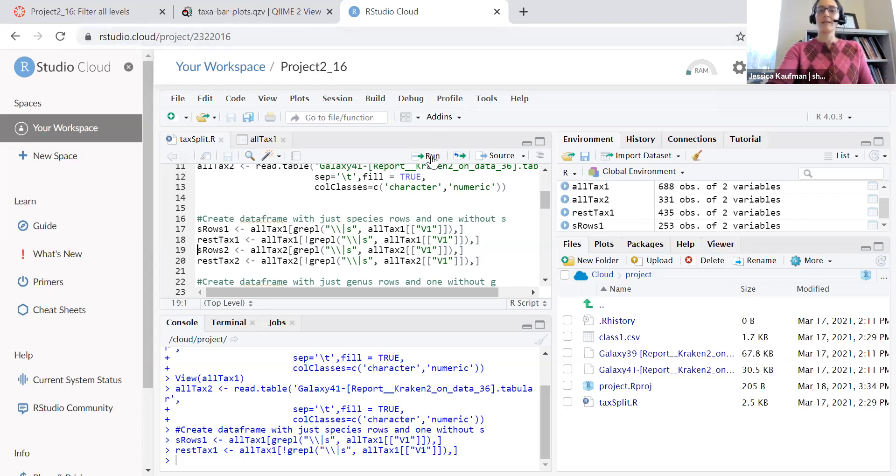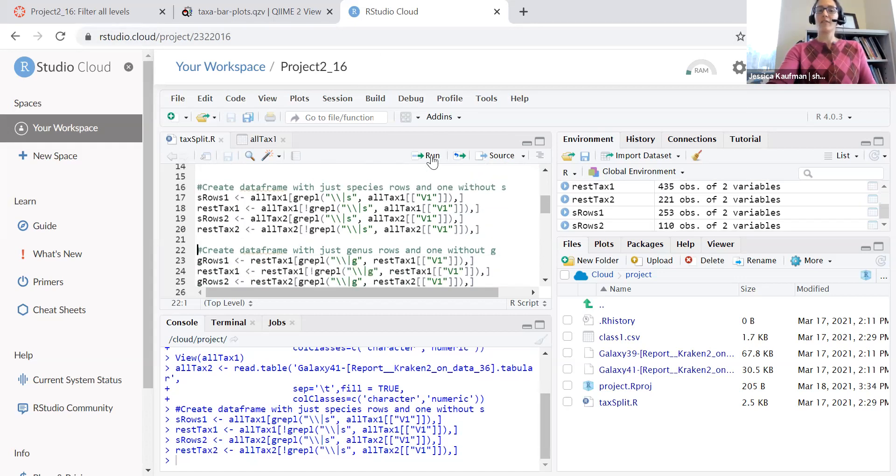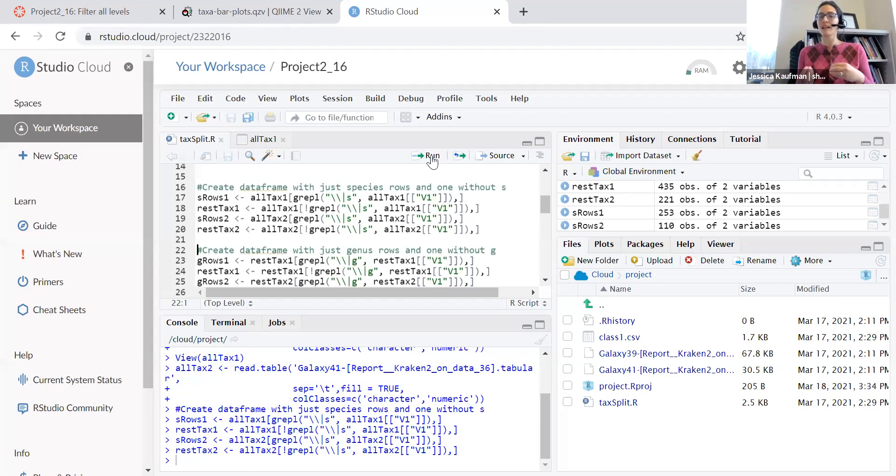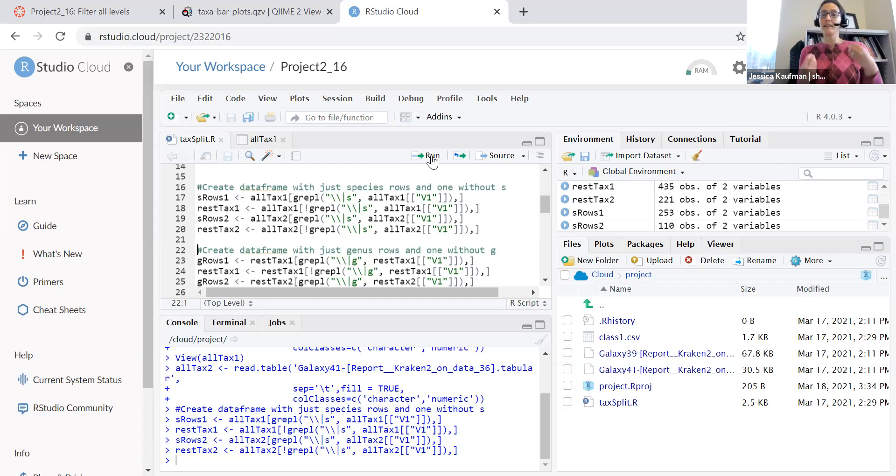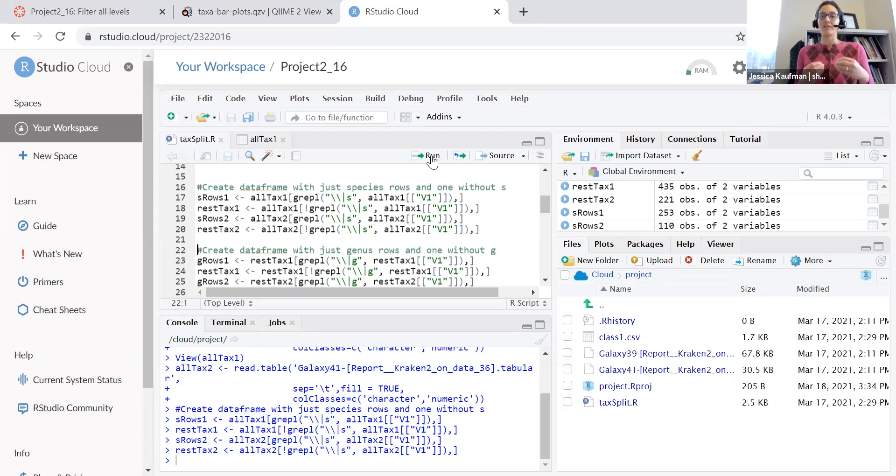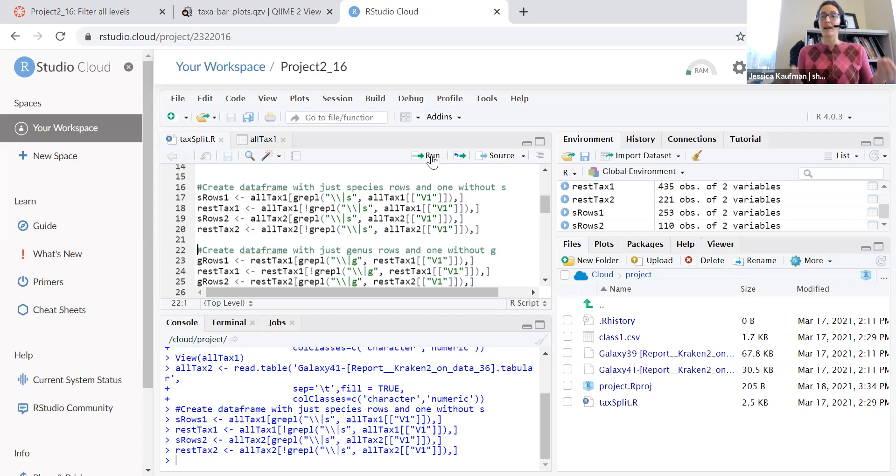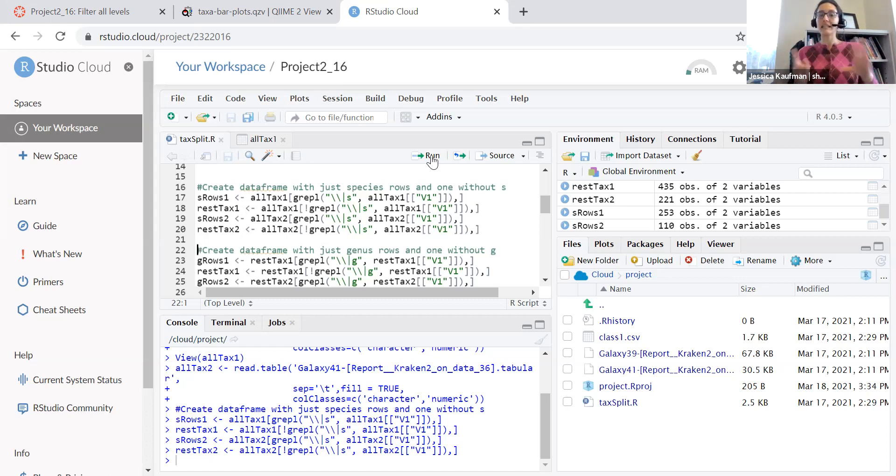Do the same logic for my second sample and now I have an s rows 2 data frame that I could write to a file with the species and I have an s rows 1 that I can write to the file, write to the file with all the species for sample 1 and I have two rest tax data frames that I can use for the next levels in taxonomy.